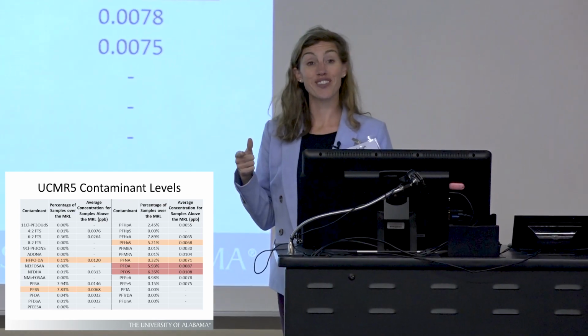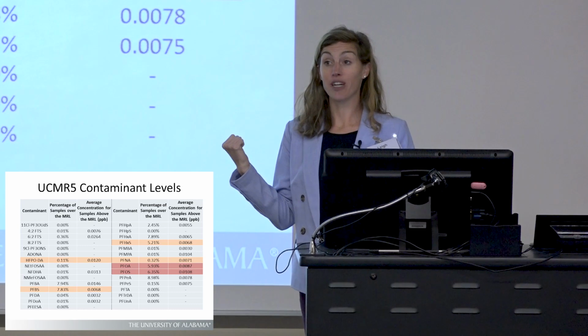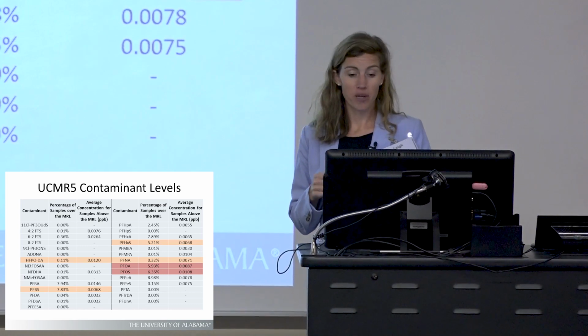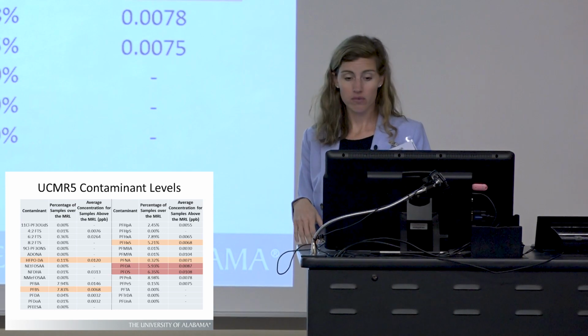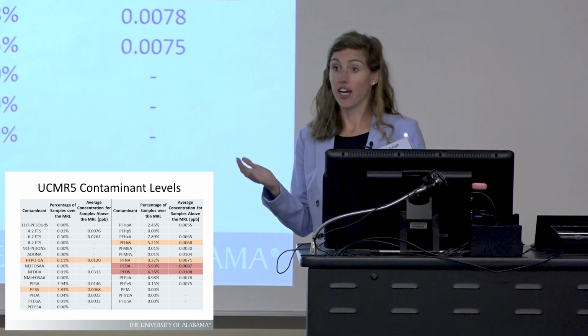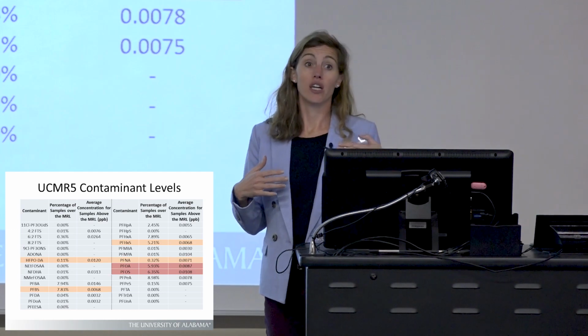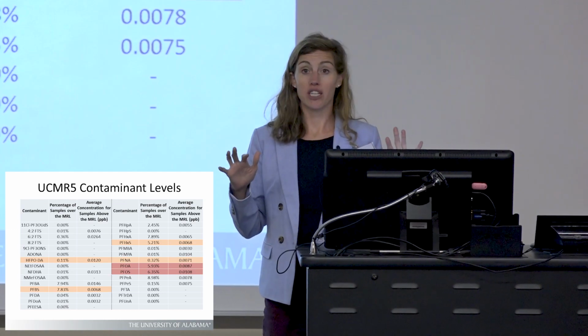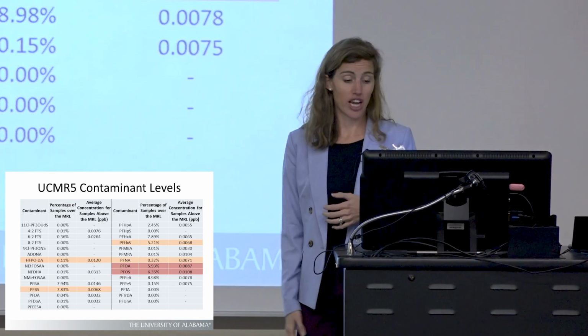What was the regulation in? Trillion. So multiply this number times 1,000. So for PFOS, it would be showing up as about 10 parts per trillion. PFOA would be 8, and the goal maximum contaminant level was 4 parts per trillion. So again, this is only 15% of the data. We still have a lot more to learn, but it's good insights into what's actually happening.